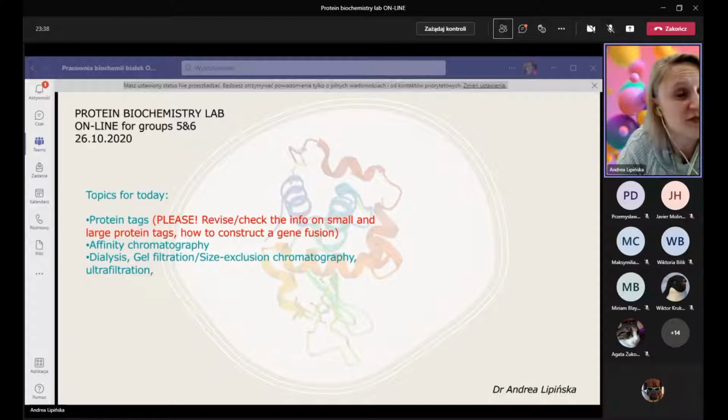Your gene of interest should have no start codon. Usually we remove the start codon. Although this is bacterial translation, and it should recognize the Shine-Dalgarno sequence, which is in front of GST, still it's the safest just to remove your start codon, so only ATG, and then you take the sequence of, for example, CD81. This is a fragment of the protein, so for sure without the start codon, and you add the stop codon either at the end of your gene, but in the pGEX plasmids there are also stop codons, usually in different open reading frames also in the plasmid, just to make sure that there is termination of translation, and then the transcript is proper.